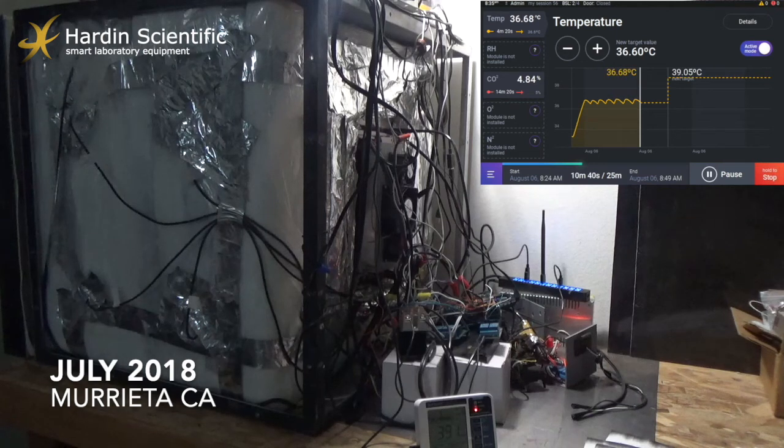As you can see, we have some amplitude of temperature around the target, and right now in this room we have 29 Celsius degrees. It's pretty high, and the difference between temperature outside of the chamber and inside the chamber is not so big, right? It's about 7 Celsius degrees.